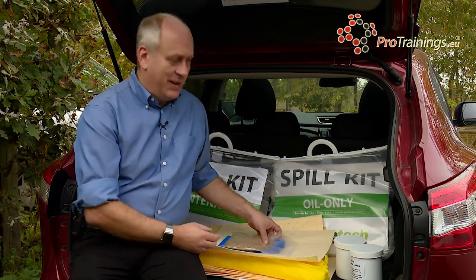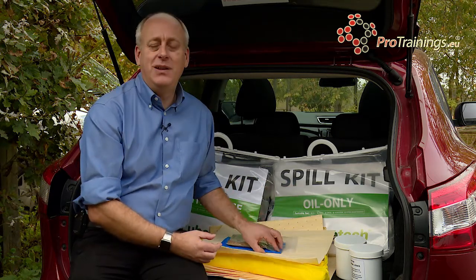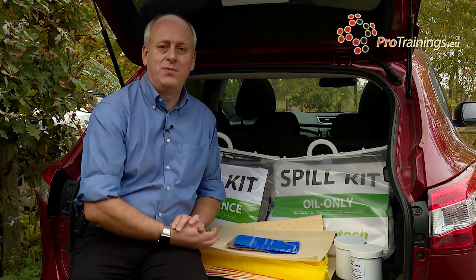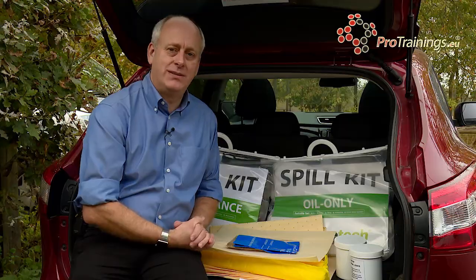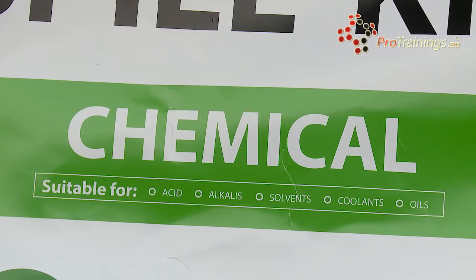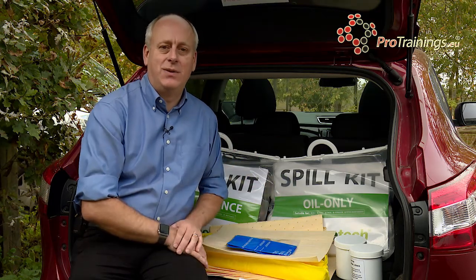The final thing with any of these chemical spill kits is disposal. Once you put everything into the bag, you need to make sure that you have disposed of all of these wastes in accordance with workplace policies and procedures. And remember, always wear gloves and PPE when you are handling any of these chemicals, even when they are in the bag and you are transporting them to the waste disposal area.